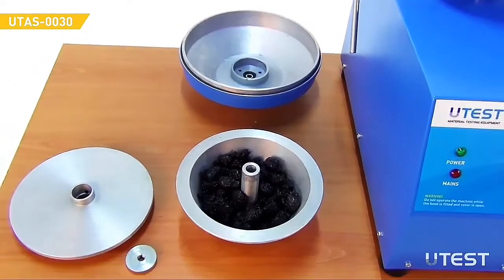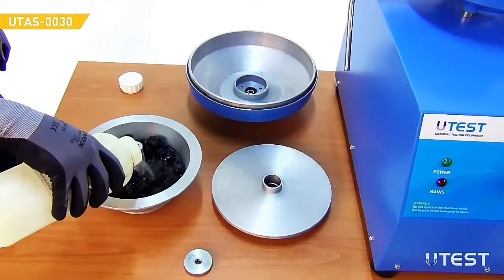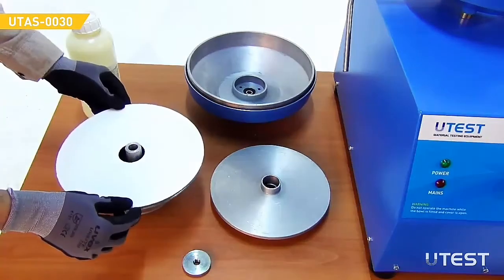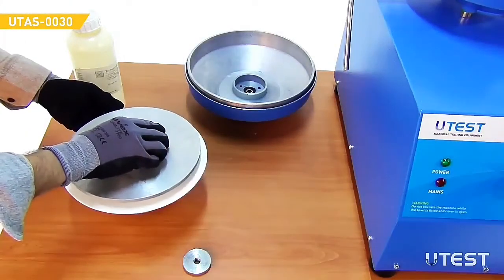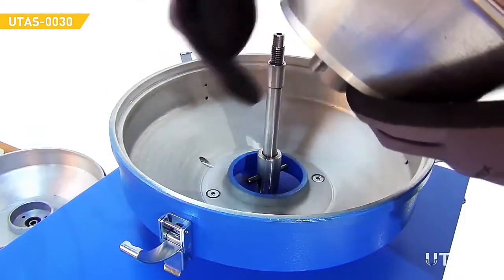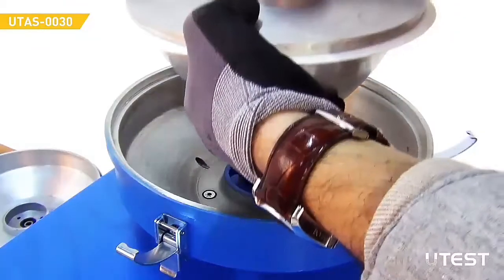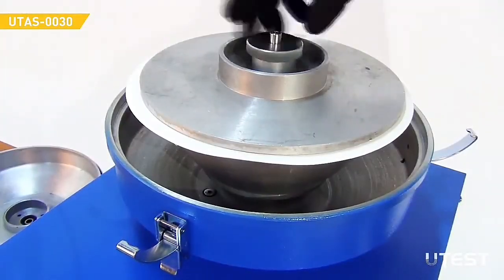Place the portion of test material evenly in the bowl and add sufficient solvent to cover it. Place a filter paper ring on top of the bowl and place the cover. Place the bowl assembly onto the drive shaft, ensuring that the slot in the base of the bowl engages with the driving spigot.